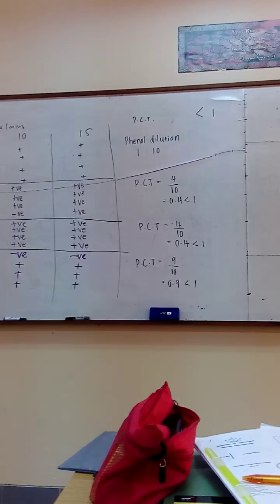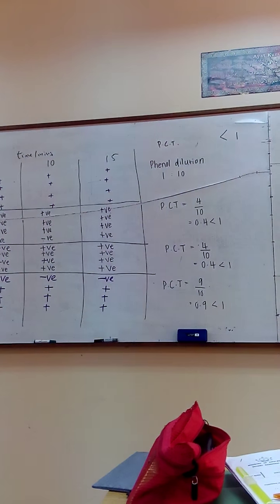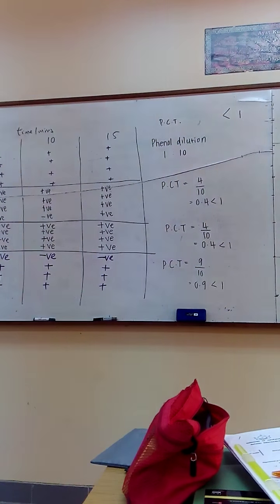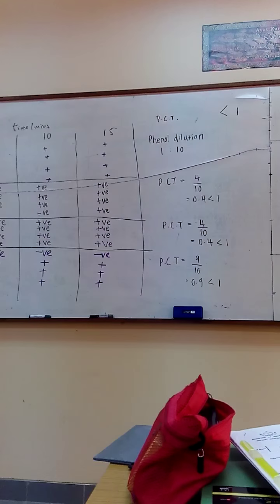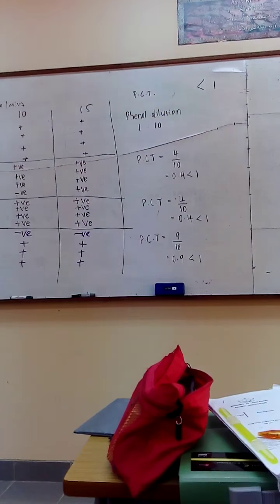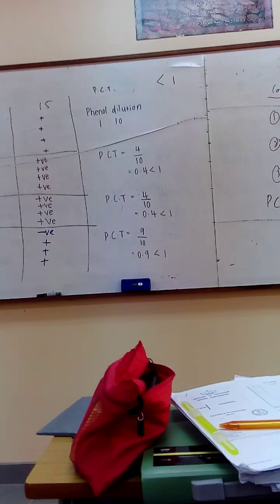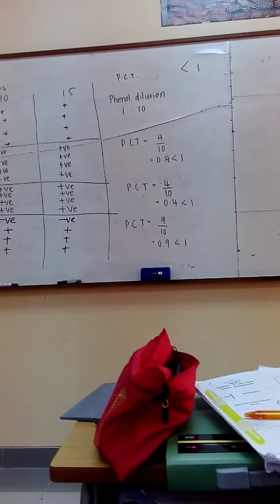Considered. But for now, it is positive. So your dilution for phenol is 1:10. And then biocidal, if you see there, 1:19 is negative, but it's still not reliable to take that, because from all the dilutions, 1:4, 1:9, it's all positive. Only one is negative, so we still consider 1:4 as the dilution of the tested disinfectant for biocidal.